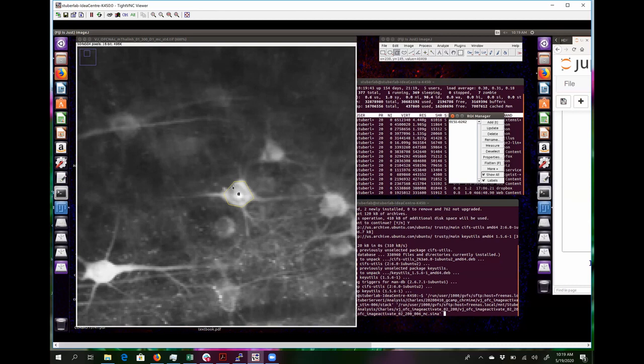You're trying to calculate the average intensity of this cell on any given frame. So that's the purpose of this ROI, right? So on every frame, your extraction algorithm takes in the average of all these pixels and then says, well, that's the fluorescence level of my cell. And then on the frames where the cells moved, let's say the cells shifted all the way here. So it's pretty steep motion. So the cell sort of lying like that.